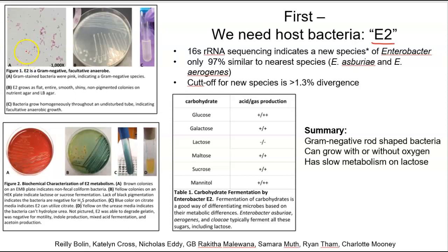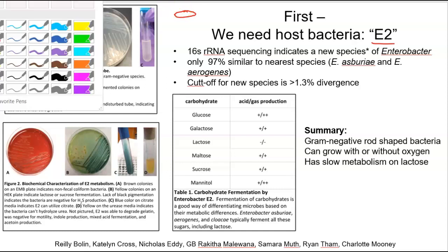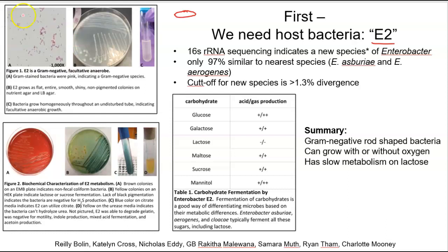You've got these very small rod-shaped bacteria, and this is a gram stain. It's a test that you can do to kind of generally categorize the bacteria. So some bacteria have a thick cell wall, and other bacteria have a thin cell wall and then an outer membrane surrounding it. And those bacteria stain pink. Other bacteria would stain purple. So these bacteria stained pink. So you see these very small pink little rods.